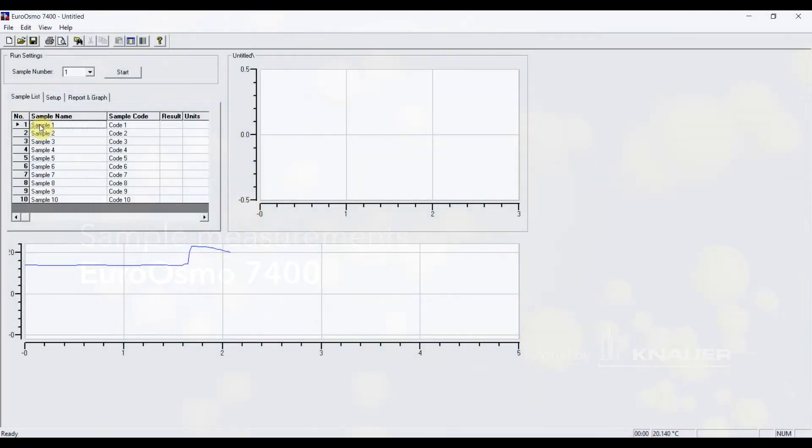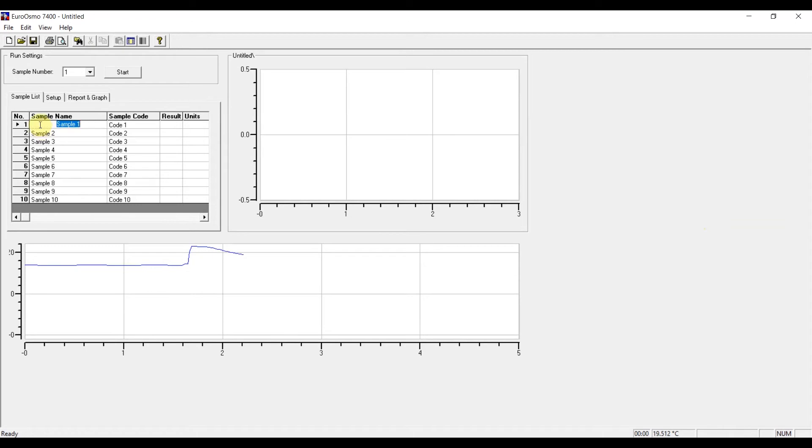Prior to starting the measurements, we would recommend to insert the sample names, or if you are calibrating, the calibration steps, into the sample name window.